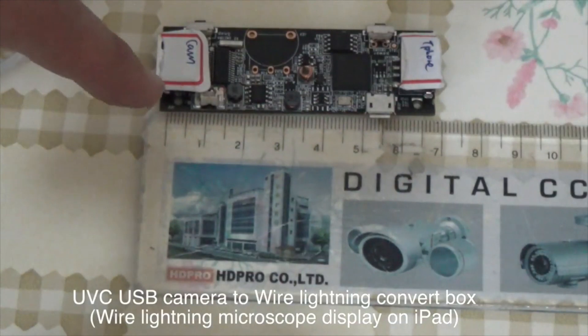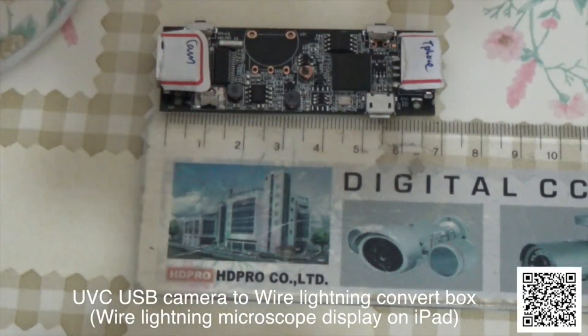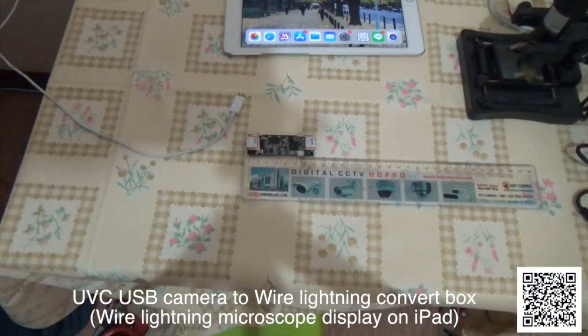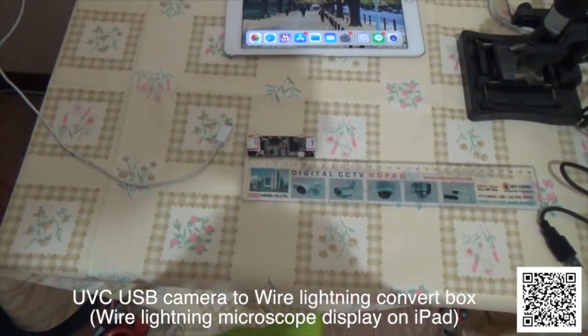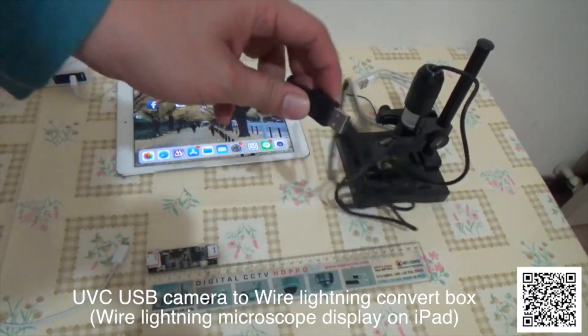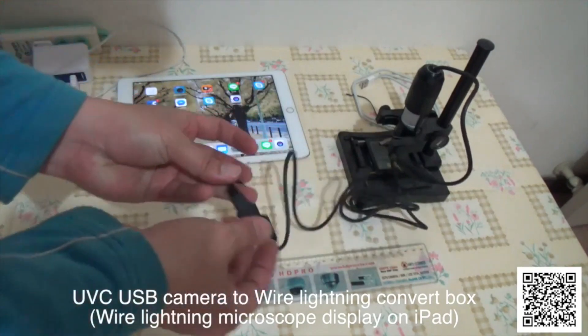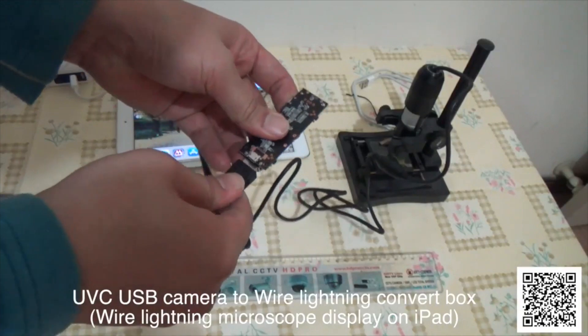This is a USB webcam to lighting wire connector box. You can let a USB camera or USB microscope display on an iPad or iPhone by wire connection. This is a USB microscope. Now plug in the converter box.